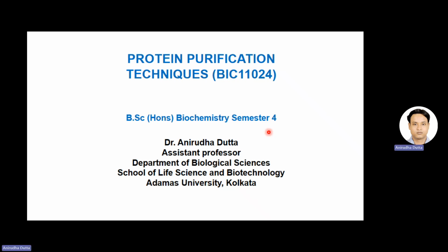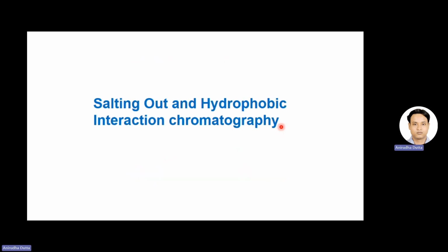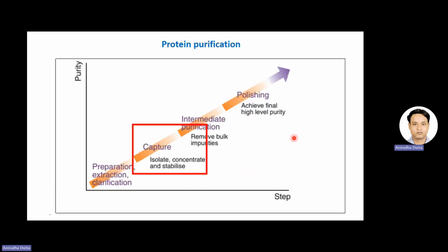Hello everyone. So today we are going to discuss our next topic, that is salting out and hydrophobic interaction chromatography. Okay. So as you remember that same flow diagram where we explained the different steps of protein purification. So salting out is also a step of protein capturing in our purification flow chart.